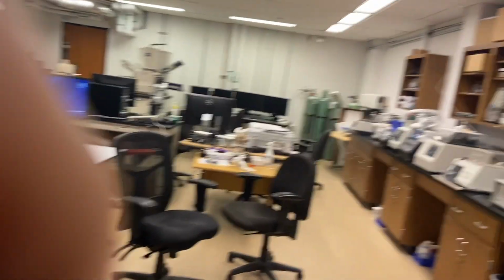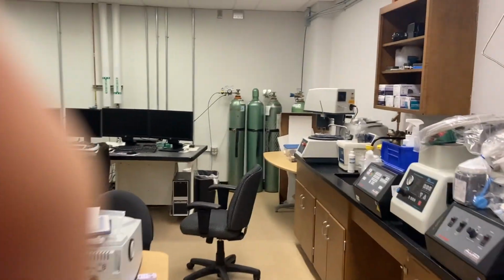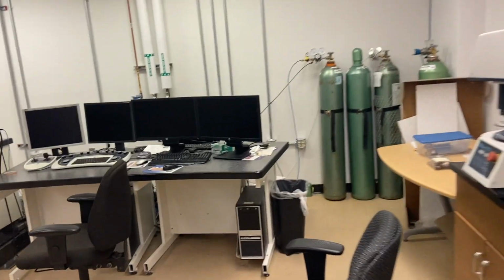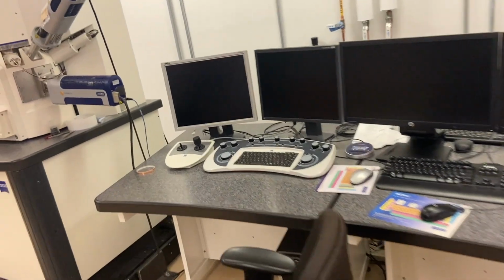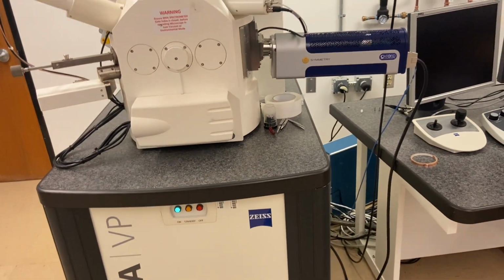And we are home. Welcome one, welcome all. Daniel Sheikh here. Today, we're going to be classifying two meteorites, at least I think they're meteorites, using our trusty old friend, the Scanning Electron Microscope, or as I like to call it, the SEM.